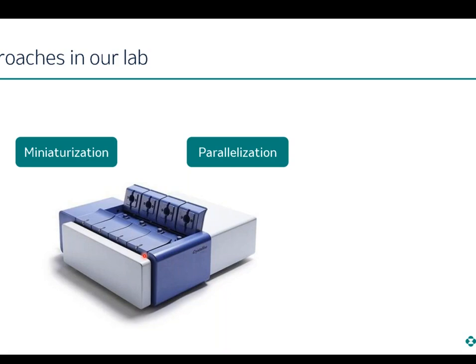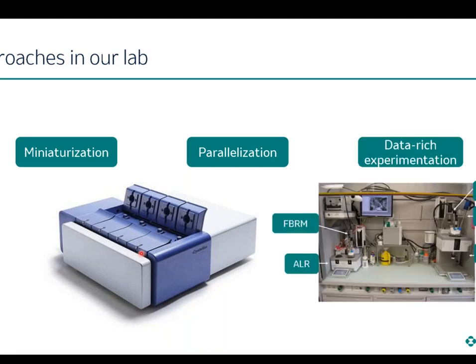We also have the possibility to use a Raman in case there are solid form questions. This starts at 2 to 8 milliliters and works pretty well, and I've been using this for this project extensively. Once we go to larger scales, we have automated lab reactors, as shown here on the right-hand side, at the 100 mL and the liter scale.